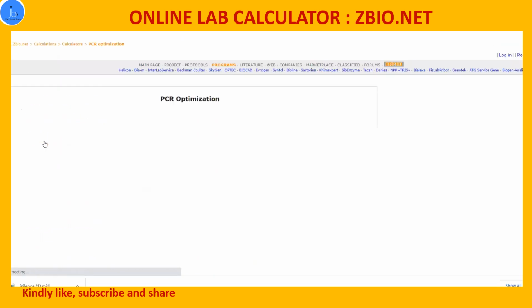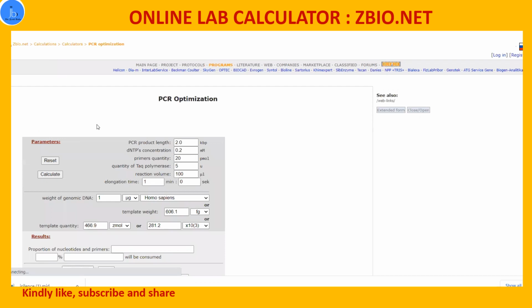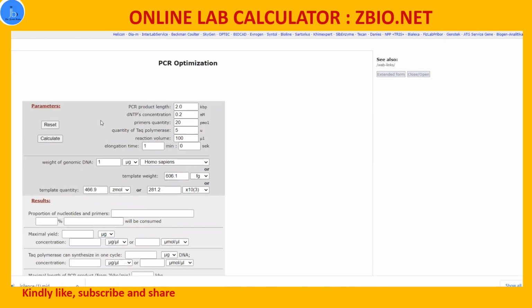Similarly, if you are doing PCR related experiments, many a time we have to troubleshoot, we have to standardize these things. So here you have all these calculation options. Based on what kind of template, how much template, what concentration you are using, what your total reaction volume is, you can put in your values and calculate how much template you require, how much dNTPs you require. This is also very important, because many a time you have to standardize your own PCR. So this you can perform here.